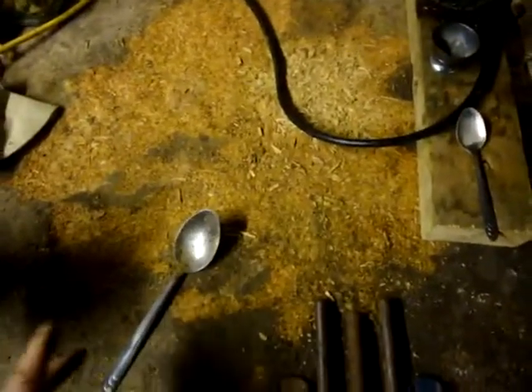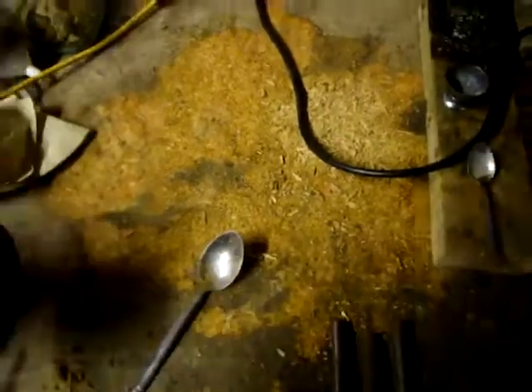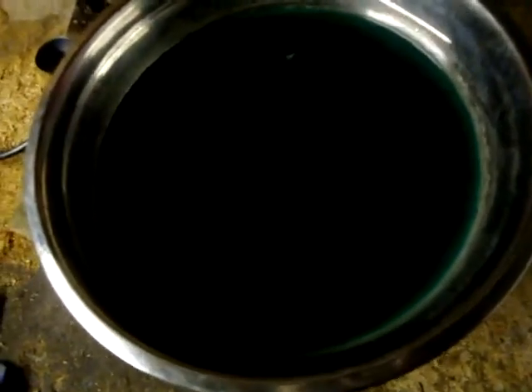So then what I've had to do is scrape my workbench up like this. Can you imagine? Because it all ballooned up, because it's only chipboard and obviously nitric acid, or silver nitrate is what it was. Obviously it ballooned all up, so I scraped it all off and then collected it and soaked it. And this is the rest of the acid in here, which I'm still extracting.